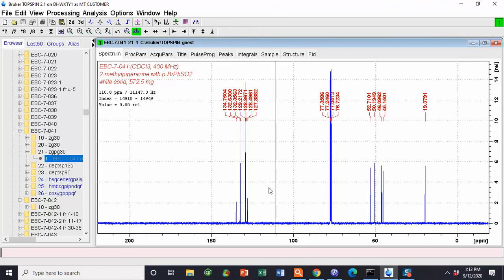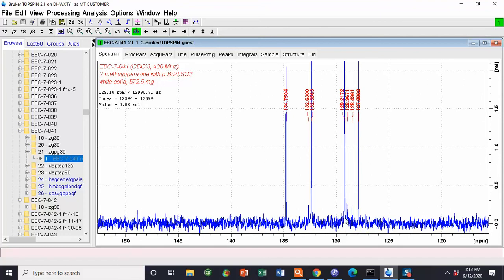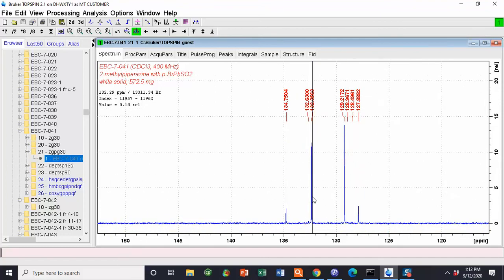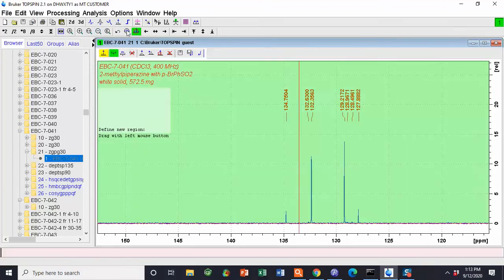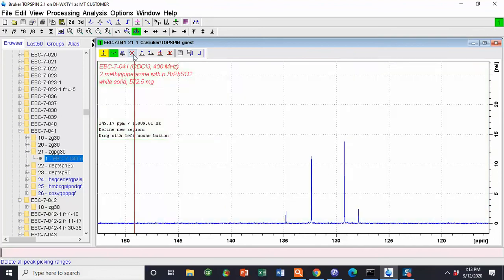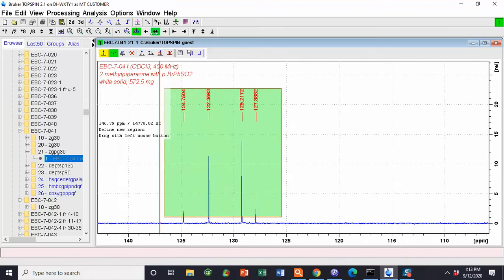We do not want these peaks picked, and also if you zoom in and look, it has once again picked all the little tiny peaks on baseline. But if you zoom out, you can tell that those peaks aren't actually significant. So we go into manual peak picking, and we just hit delete all. It is automatically in that mode, so you can click and drag and peak pick. It does not matter that each of these peaks isn't in its own little box. It only calls the numbers. It does not determine anything else relating to them.